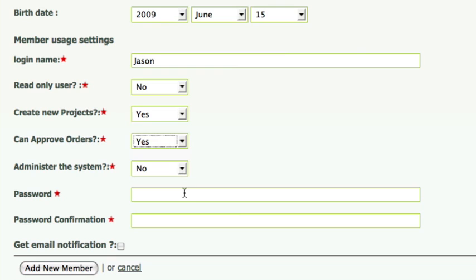I'll choose a password for Jason and he will be able to change it later. By checking get email notification, Jason will get an email with his login name, password, and a link to the system.